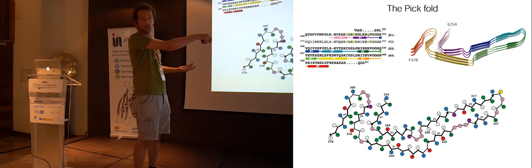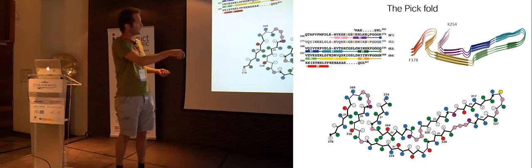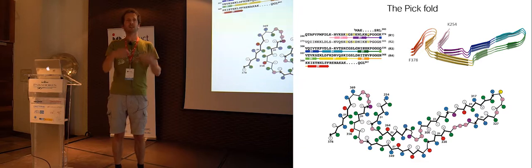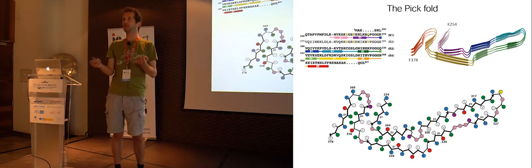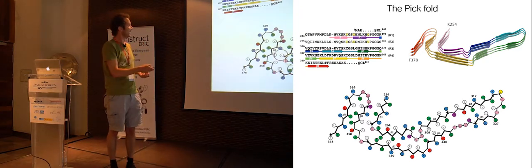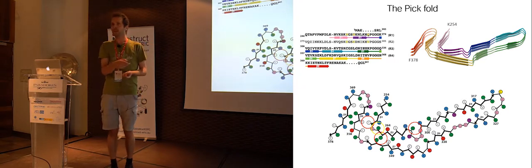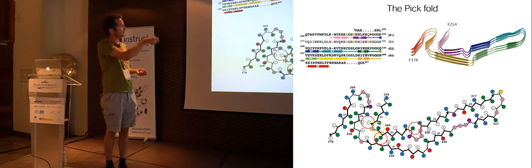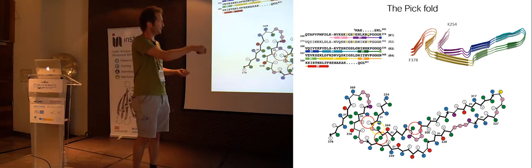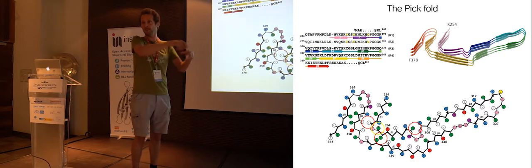That's where that jump happens. But you can see that even though 306 to 378 is again part of the protofilament structure, it folds up in a completely different manner in the Pick structure, where you now have this very elongated J-shaped structure. And if you now compare the sequence of the first and the second microtubule binding repeat, you can see that there are some mutations between the two which make it impossible for the second repeat to fold in here. You have a beta-branched valine here for the second repeat, which will clash into the glycine in a very tight turn here.